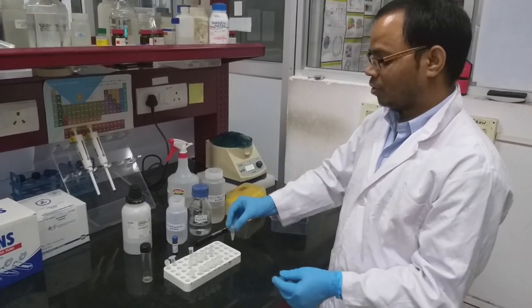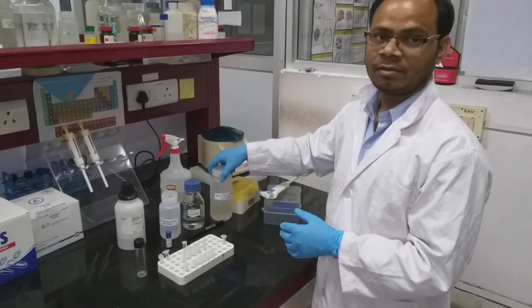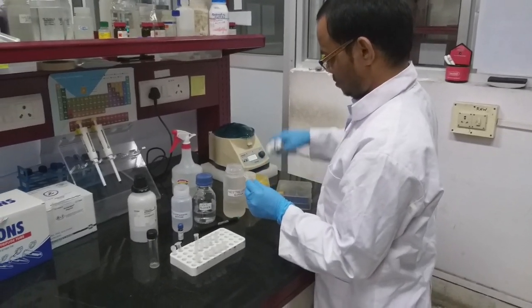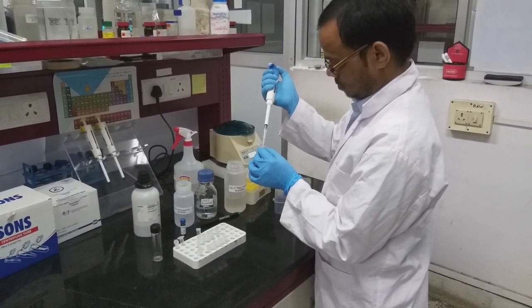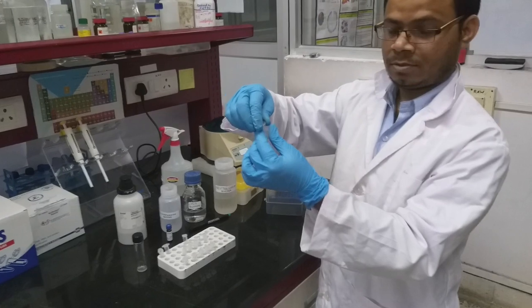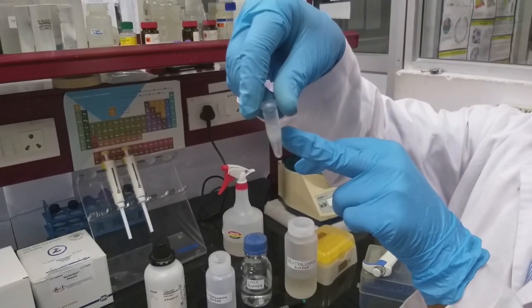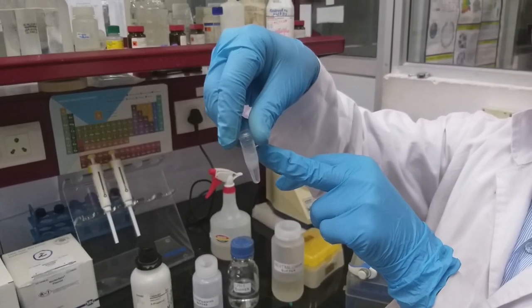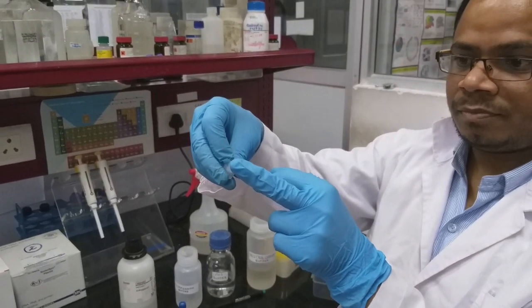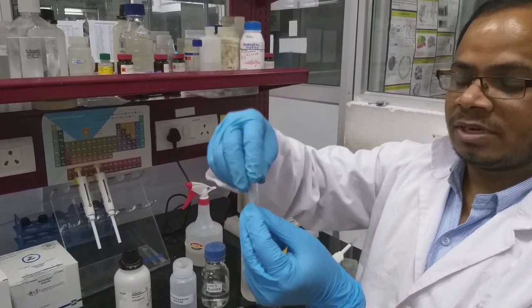Next step, we have to neutralize the sodium hydroxide using neutralization buffer to prevent any further degradation. After adding neutralization buffer, you can see there is a white precipitate. That means all the proteins are precipitated by the neutralization buffer. You can flip the tube 2-3 times to completely precipitate all the remaining proteins.